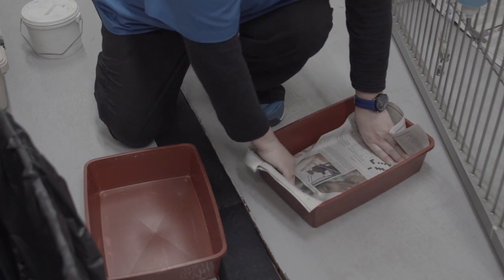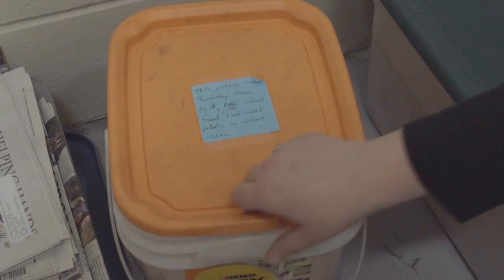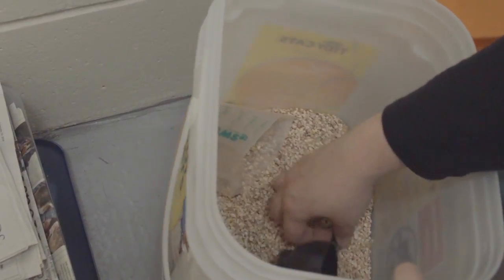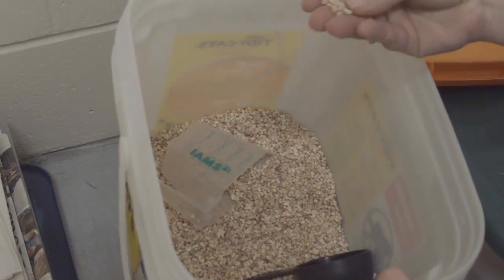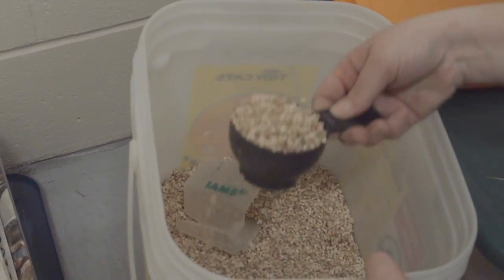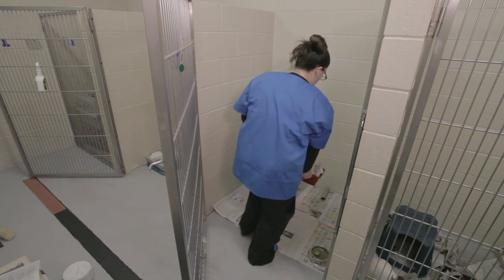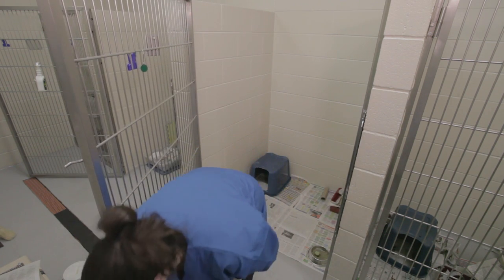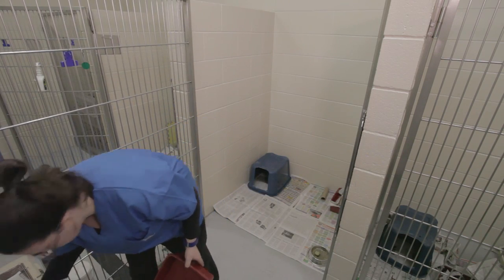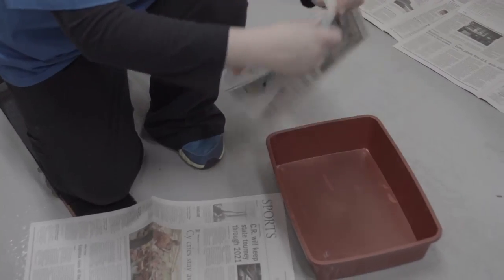So we'll line the litter box with paper, and then put a scoop of the litter we have. The litter we use for the rabbit's litter box is a rodent litter — not Tidy Cats, just using that container. These little pellets — they get one scoop per box. That's going to go here on the right side in the corner, and then the other box: you put just some shredded newspaper in there.